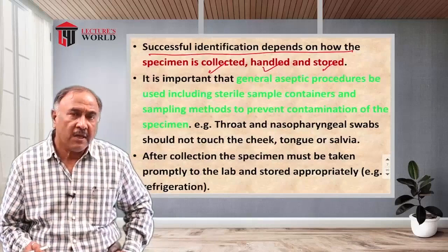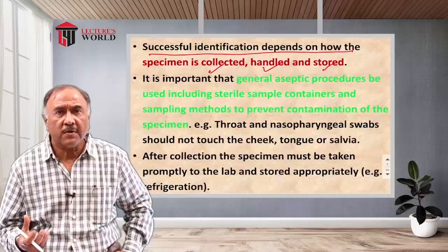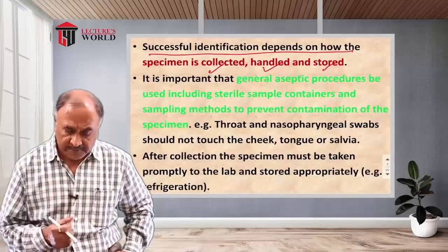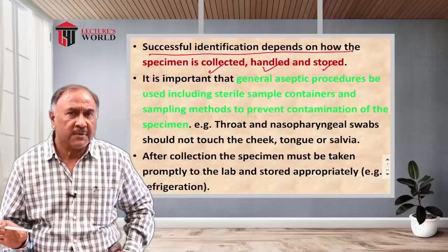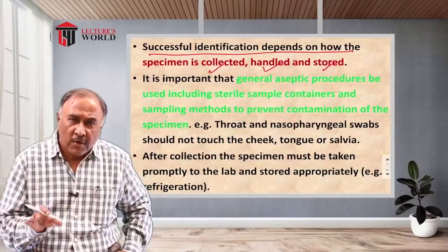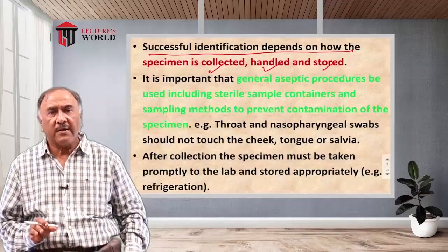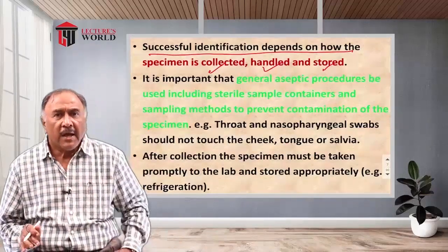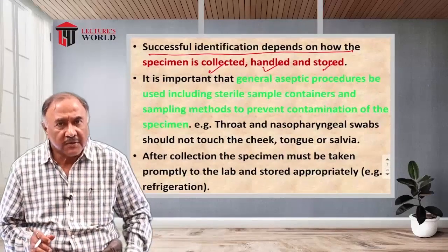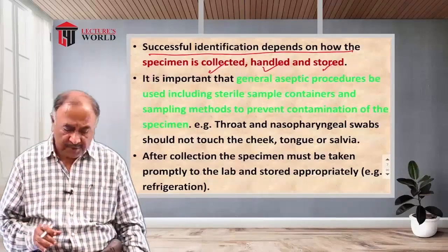While other organisms lose the color because of a harsh acid alcohol treatment. So the rest of the organisms other than mycobacteria would be colorless when we wash them with acid alcohol, and finally with the help of a secondary stain, they can be re-stained either blue or green by using methylene blue or malachite green respectively.